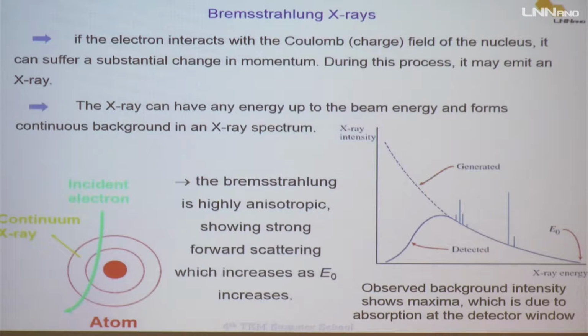This is the idea. It will generate X-ray photons that will come from the maximum energy, the E0, the energy of the beam, to zero.